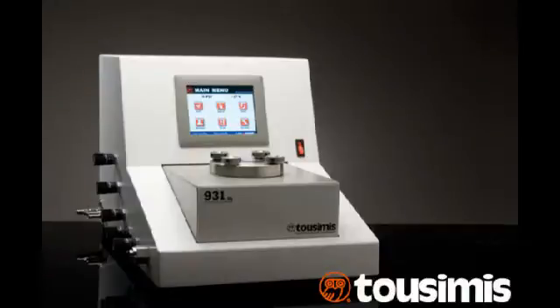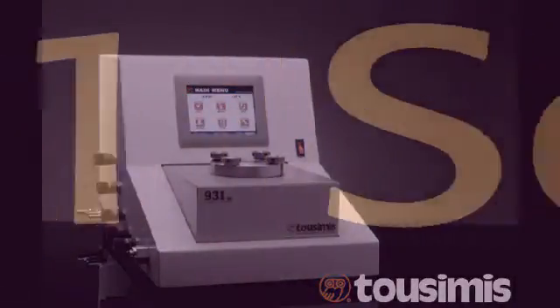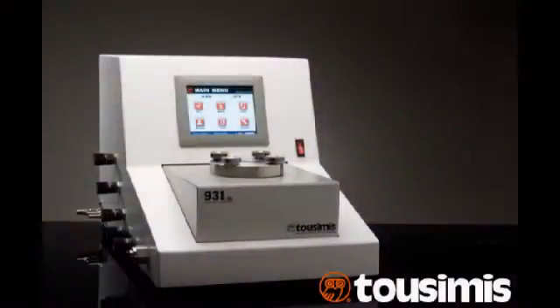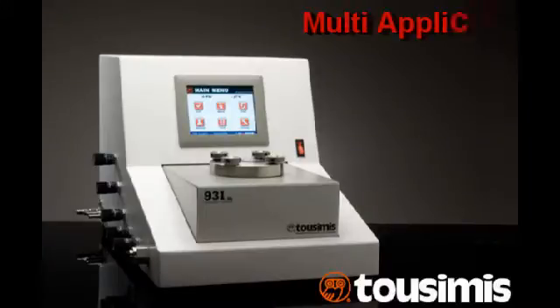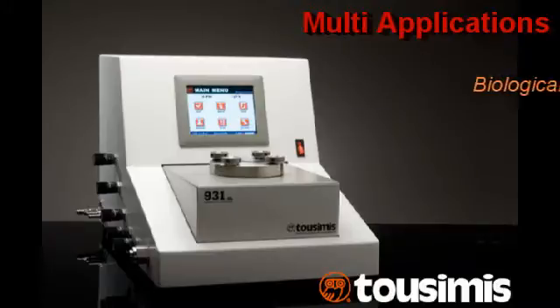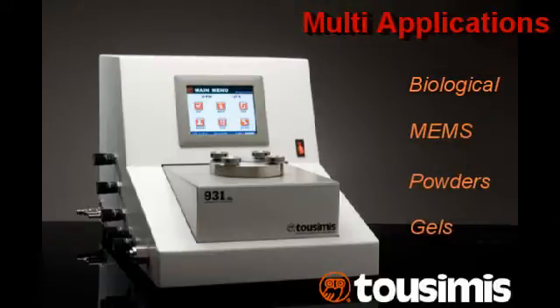We at TUSIMAS are pleased to introduce the Advanced Touchscreen 931 series to our family of critical point dryers. The 931 uses new advanced programming specifically designed for multi-application processing. From bio to mems to patters to gels, the 931 stands ready to take on your most difficult samples.